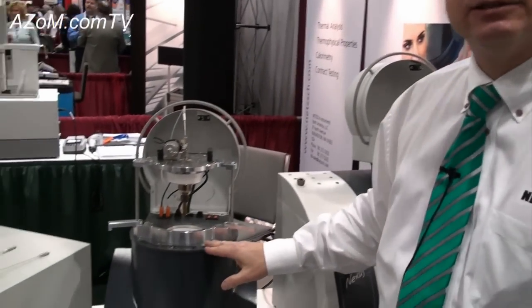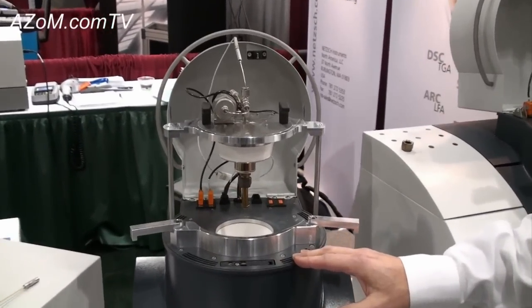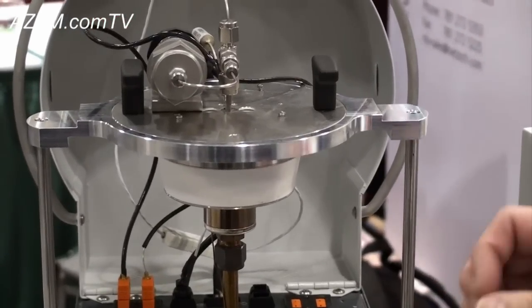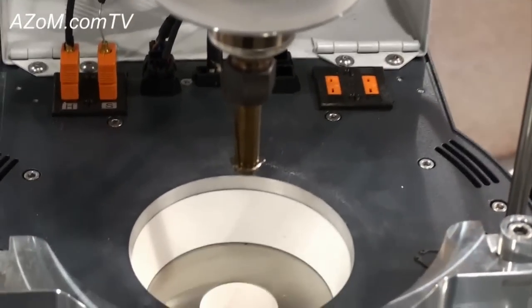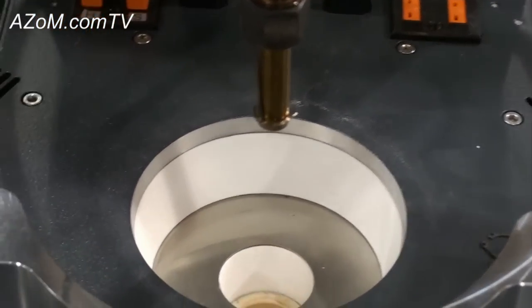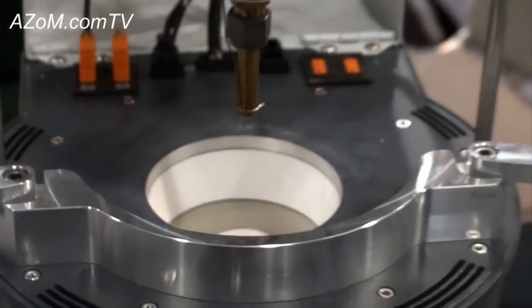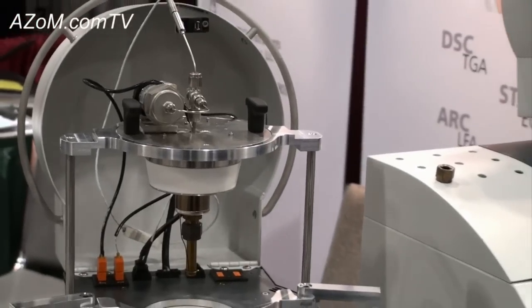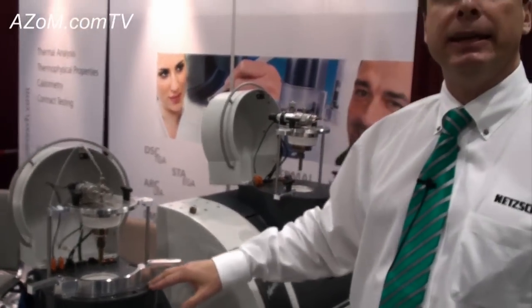Another module we have is a traditional accelerating rate calorimeter, which is used in process safety. An accelerating rate calorimeter keeps the sample in an adiabatic condition. It's used to simulate the reactions that might occur in a large batch reactor, where you want to make sure that over time you're not going to have a runaway reaction that could cause a safety hazard. This module is designed to simulate the adiabatic condition of a large reactor vessel — we're not putting any heat in and not taking any heat out.